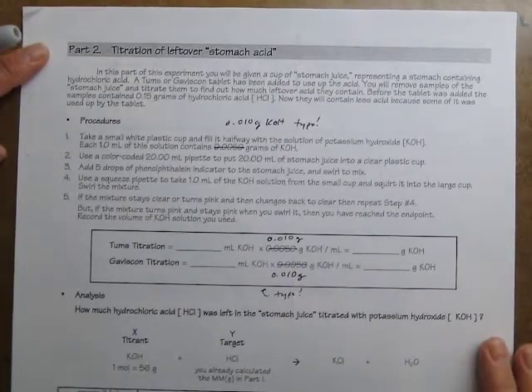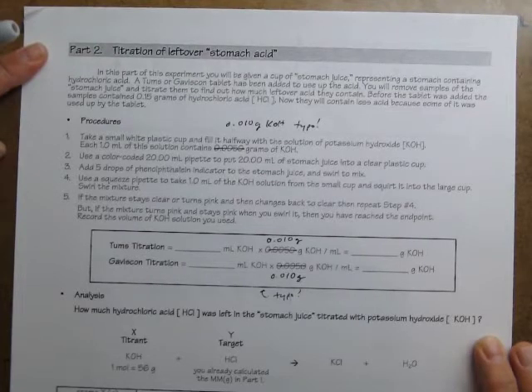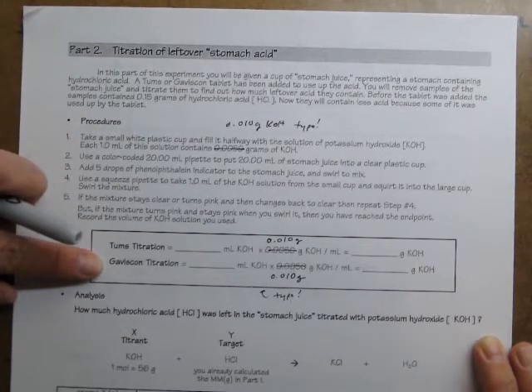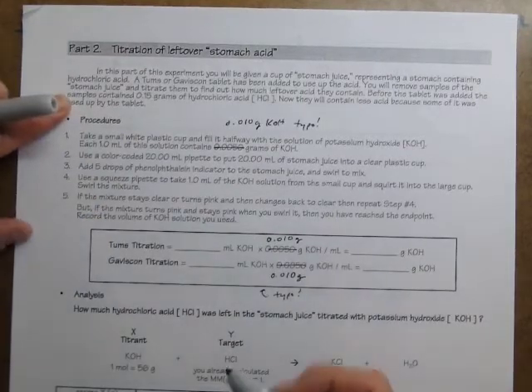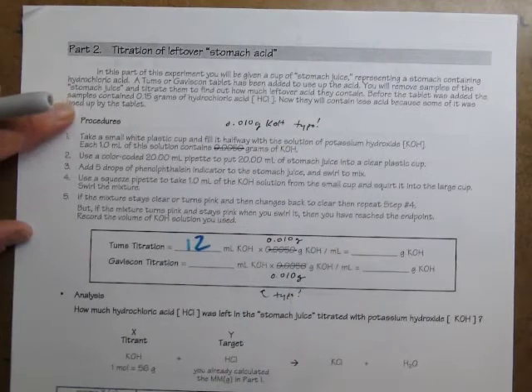Okay, I did a demonstration video showing how much of the potassium hydroxide it took to react with the acid that was left in a sample that had reacted with either the Tums or the Gaviscon. When I did the titration for Tums, it used 12 milliliters of potassium hydroxide.